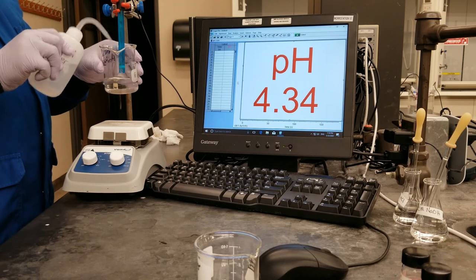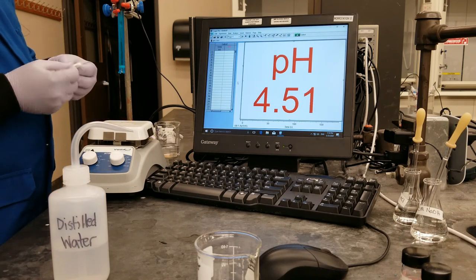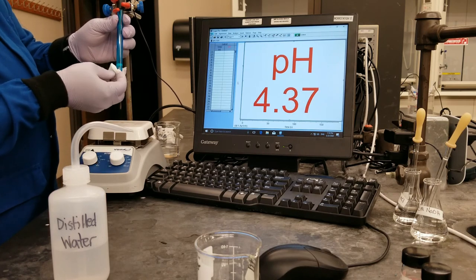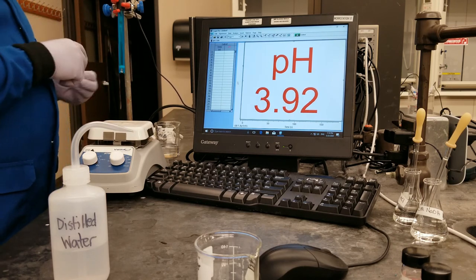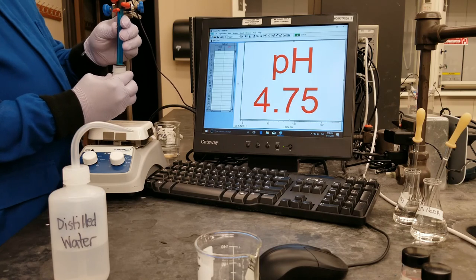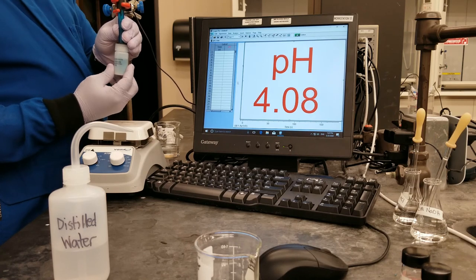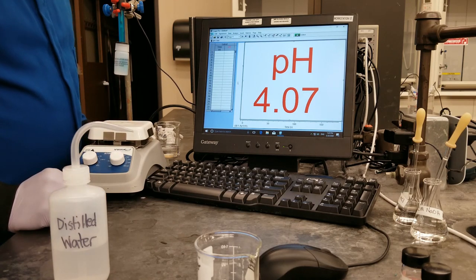So I will rinse the pH probe once again, wipe it down, and put it in the storage solution. Just like in the manual, we have demonstrated that the pH doesn't really change when you add either an acid or a base to a buffer solution. Because of the presence of the weak acid and the conjugate base in the solution, you are able to keep the pH of the solution stable. And that ends the experiment 3 lab. Thank you.